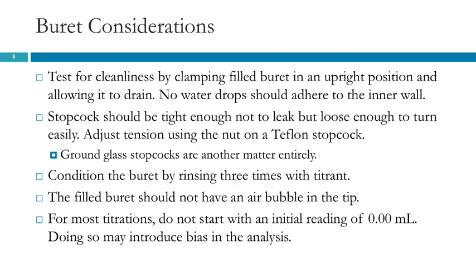So the burette needs to be clean. And how can you tell if it's clean? Well, obviously, you rinse it with DI water and it should look clean. But the real test is to fill it up with DI water, clamp it on a stand, and let the water just drain. Just be patient, let it drain out. Examine the walls of the burette. If the burette is clean, you shouldn't see any water droplets on the inside. None. The water should just sheet and run down.